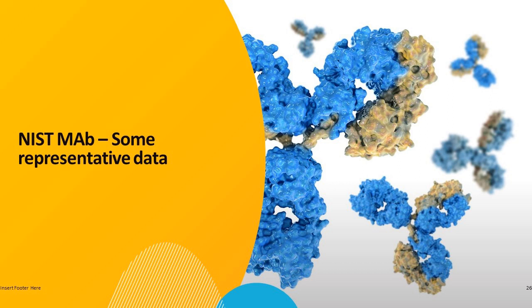So the last part of the talk is about some representative data on the NIST monoclonal antibody. This is not a comprehensive set of data. It was just acquired over a period of 3 days, and it's there just to show that even though these techniques are low throughput, the results can be obtained really quickly.